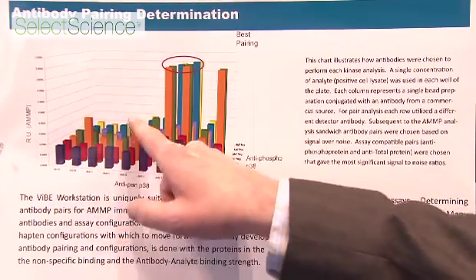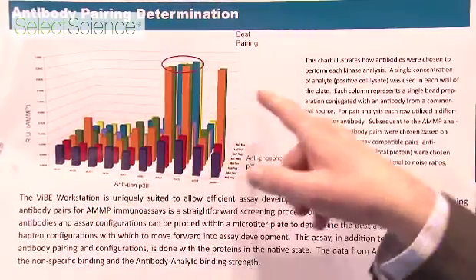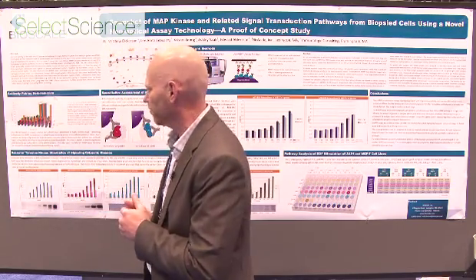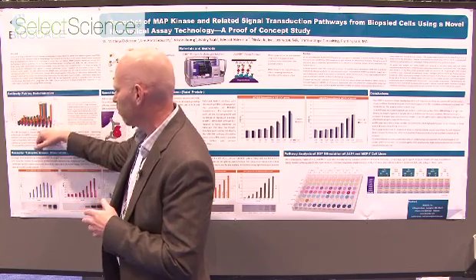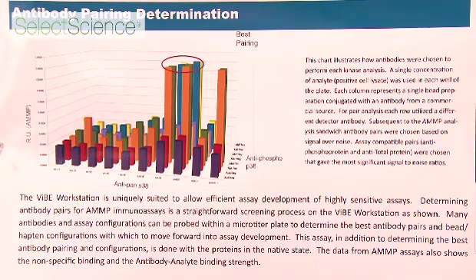We start by developing an assay by buying in antibodies from commercial vendors. And then we do a pair analysis for the assays that will function best in our technology. This is an illustration of a 96 well plate. In a 96 well plate, of course, you have columns and you have rows. For illustration purposes here, we're illustrating the assay development for the phosphorylation of P38. In the columns, we've taken antibodies that are specific for total P38. And then in the rows, we've matched those with antibodies that are specific for the phosphorylation of P38.